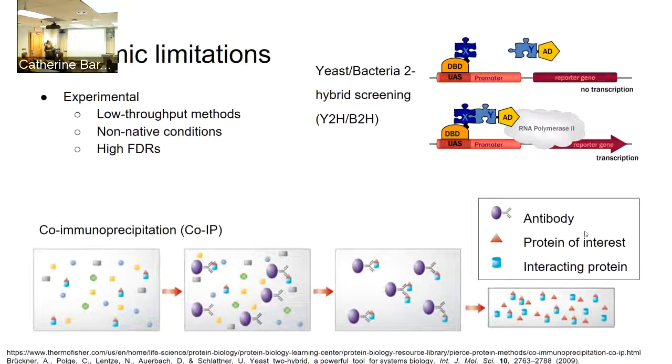And when I went into the literature, the fact that I found even one extreme example where the false discovery rate was around 70% is kind of insane. And I don't know why that isn't a bigger issue. This technique is still used all the time. It was used as the experimental method or validation for the human proteome graphic that I just showed on the previous slide. So it's not great.